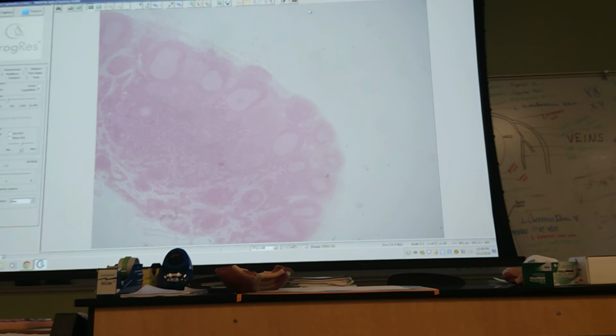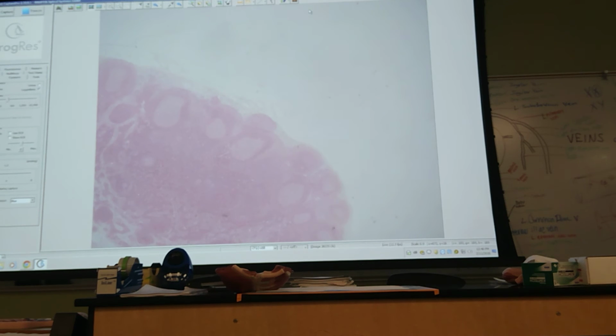We've now encountered several structures with a capsule, which is typically the outermost structure around an organ. This is not the case for lymph nodes. It has a capsule, but there's tissue outside of that, called pericapsular tissue, mostly adipose, found outside of the capsule. This is not the world's premier slide.